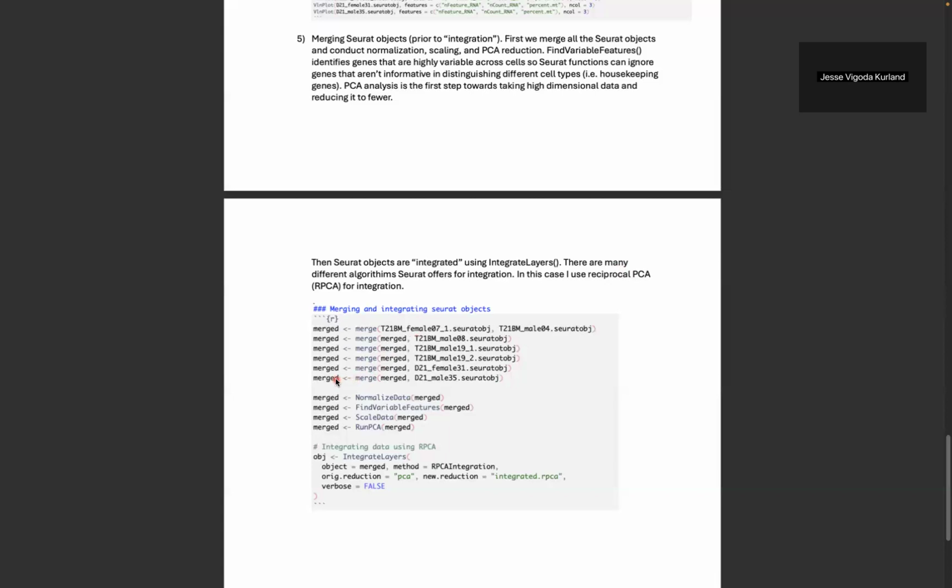I'm then going to do these 4 functions that are a really critical part of this Seurat workflow. The first thing we're going to do is normalize the count matrix, and then we're going to find variable features for each of these. Even though I'm running this on the merge, on the list, I'm normalizing each Seurat object individually, although it looks like it's all happening as a whole.